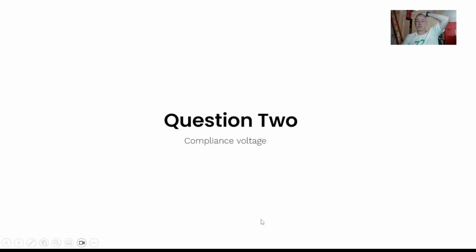I'm going to change to a next question now, which is really about compliance voltage. I finished my PhD, it sounds really daft, in about 2000. And genuinely, I hardly ever touched on the subject or the term compliance voltage. Now, why was that? I was doing electrosynthesis, which is a more high power process. And I was doing electroanalytical chemistry, but my potentiostat was much more in this vein. And in fact, on the back of this, you can see there's a connector for mains electricity. So when you're running off mains electricity and doing lab work, you've generally got more than enough power to actually do your electrochemistry.